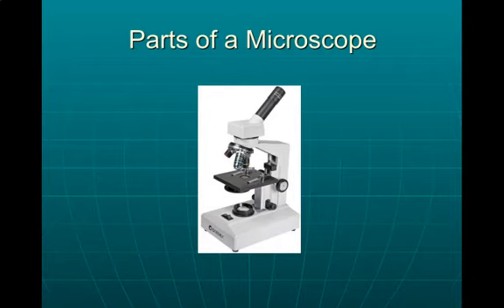You'll notice that each line has going to it a description of what that item is and then the name of that item. Please make sure that you are studying these terms so that way when you hear directions that say to raise the stage all the way up, that you know what we're talking about. Okay, instead of calling it the platform, make sure that you're calling it the correct name.